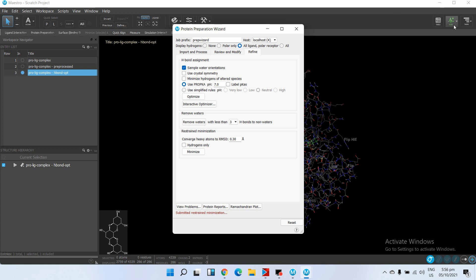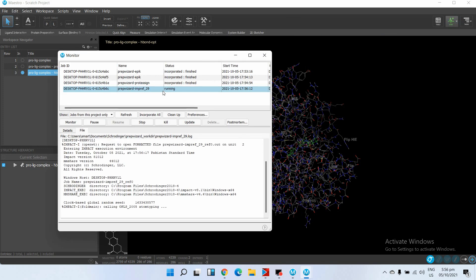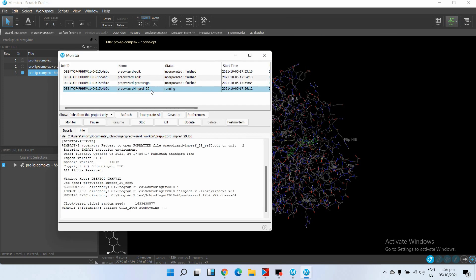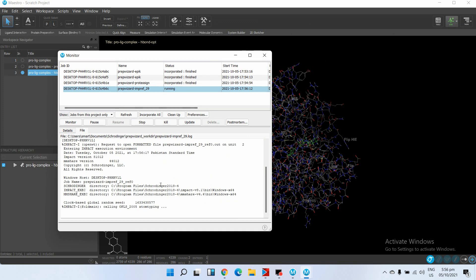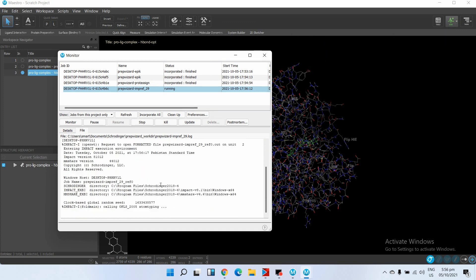You can also monitor your job by clicking on Jobs. Here all events are recorded and you can examine them if you want to know more detail about the process.